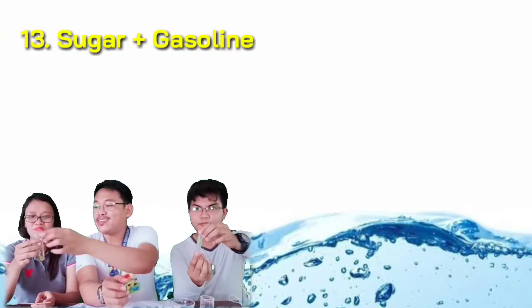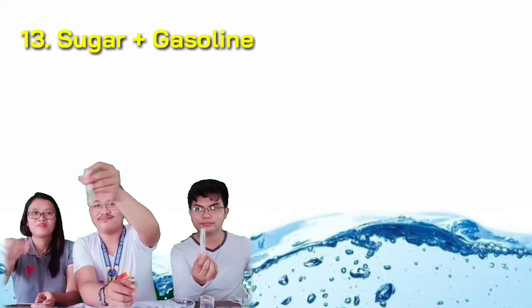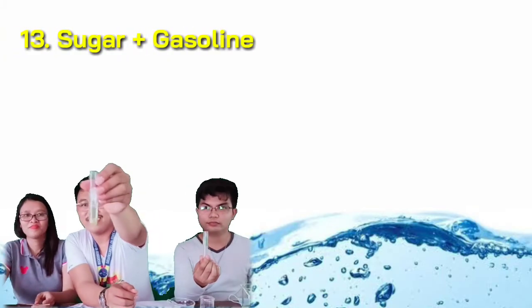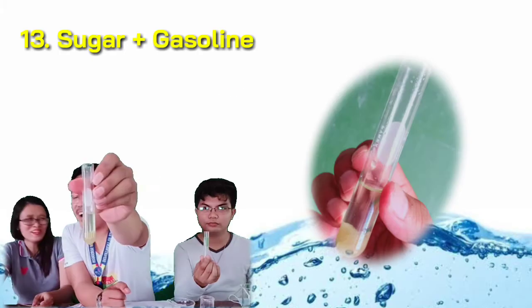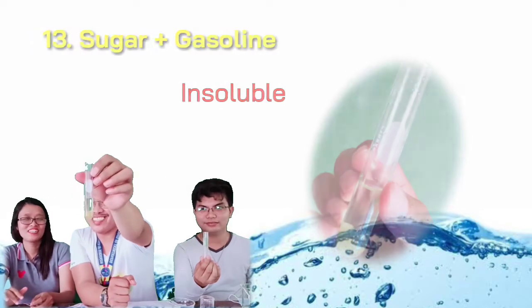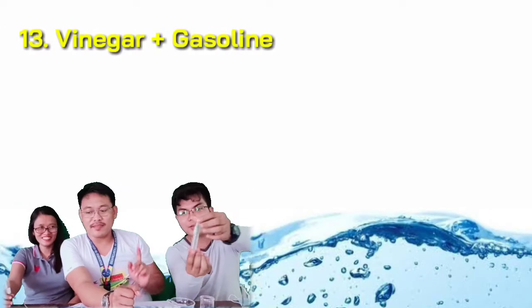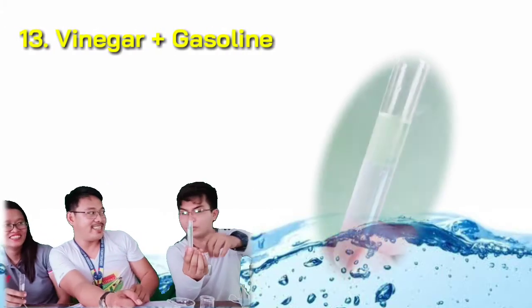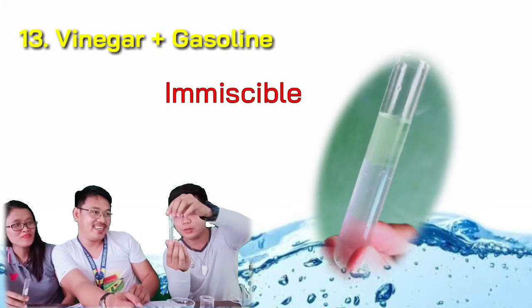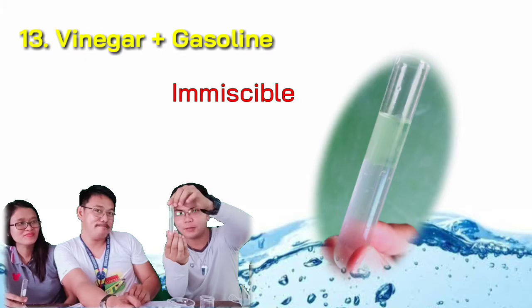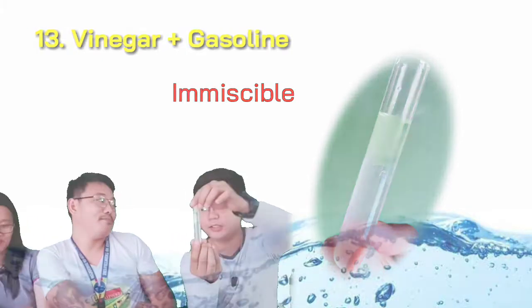For sugar and gasoline: they are insoluble. And for the last setup, vinegar and gasoline: as you can see, the mixture is immiscible. They are immiscible.